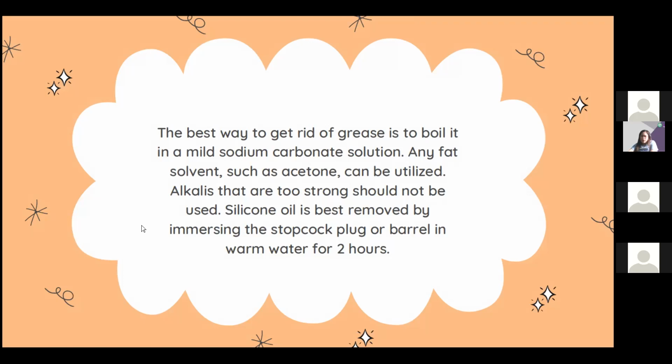Oh, okay. I have not used the silicone oil though in cleaning. But this one is the result of your research. Sa laboratory, we have not used this one in removing the stopcock plug. Oh, okay. This is for the stopcock. Okay. Not really for the grease. Okay, sige, go. Next.